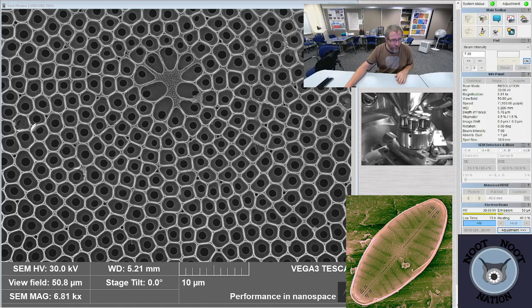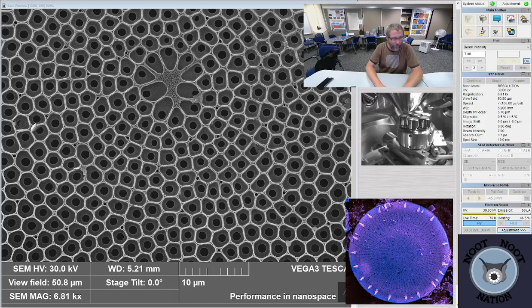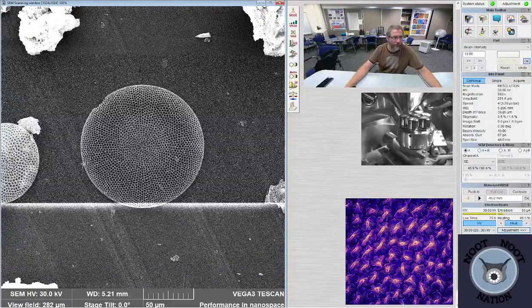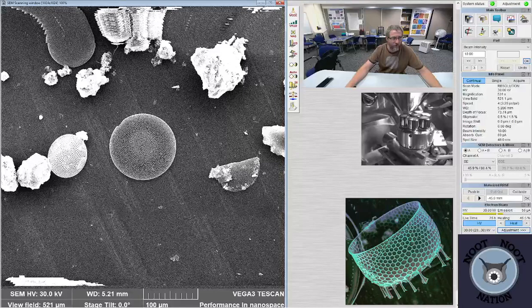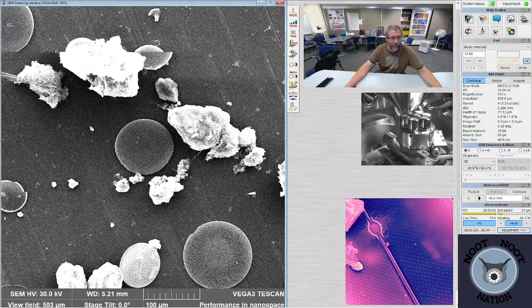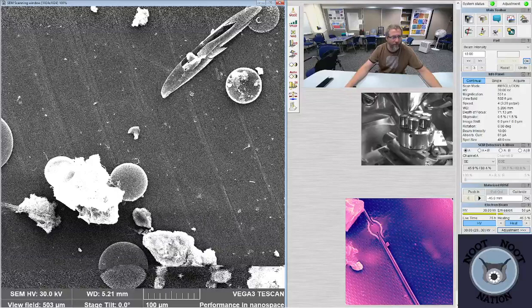In some cases, when they get digested, they don't get completely digested as a result. But basically nothing goes in between those openings. They're openings that are meant for exchange with nutrients. And they all have many different kinds. Each diatom has their own sort of pore structures and covers, those things that we usually think of as occlusions that go over the hole.